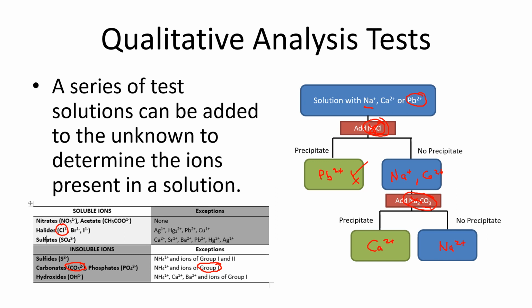So you can use a series of tests to help narrow down options starting from however many you have. This is just a small example using only 3 possibilities, but of course you can scale it up to make it as big as you want.